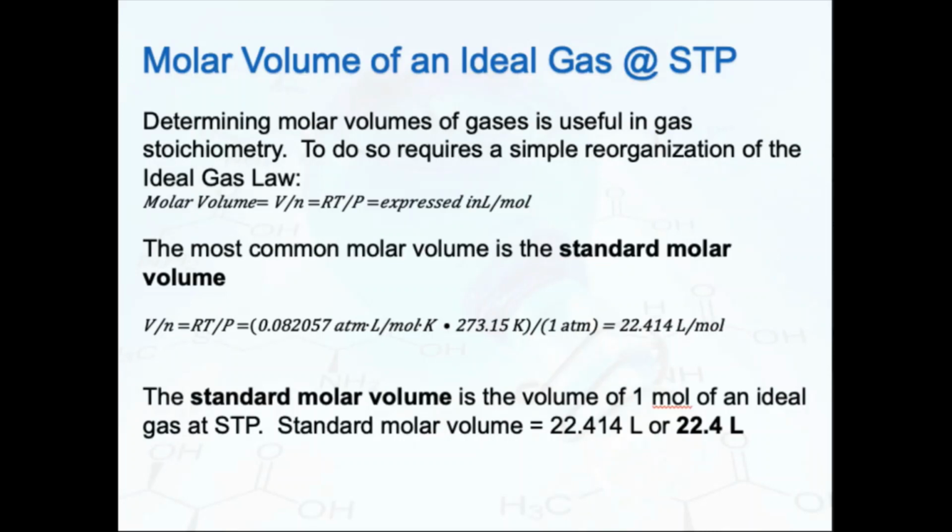This is a number, again, you're going to want to know for your own material, for your tests and things in lecture, but not necessarily for this lab. You're going to be determining your own theoretical molar volume for this lab. So just acknowledge this and then make sure that you are doing your calculations differently, okay?